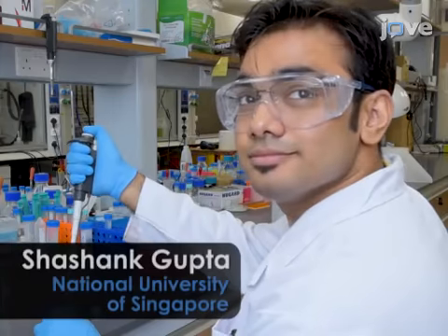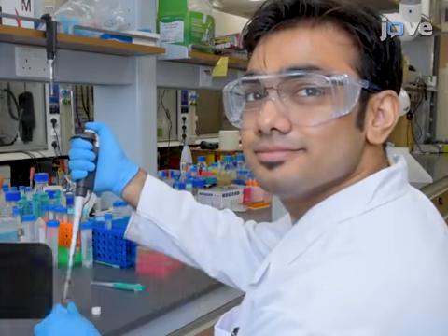Demonstrating the procedure will be Xuanwei and Shashank Gupta, grad students from my laboratory.